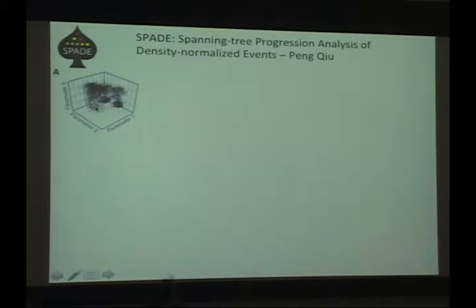And the first step of this to get good representation is to downsample the dense regions. So that's what the density-dependent downsampling step is. You can see that after that step, we've gotten rid of a lot of the cell events in the dense regions and sort of evened out the distribution of these cells. That's important just so that regions don't just get ignored during the clustering step.